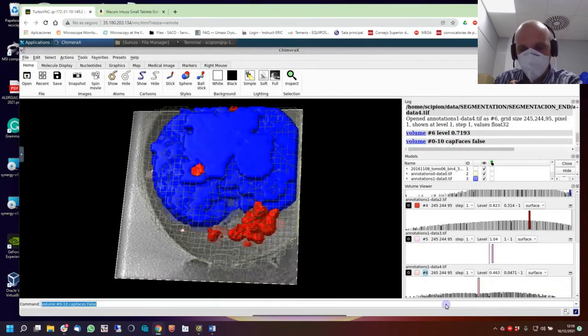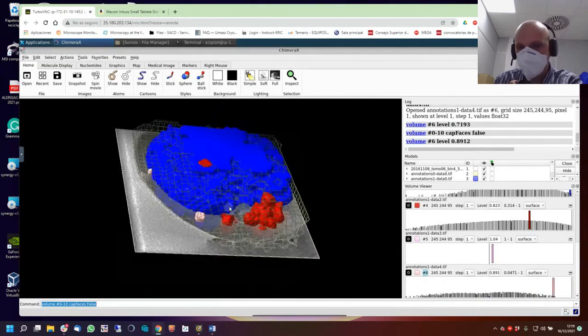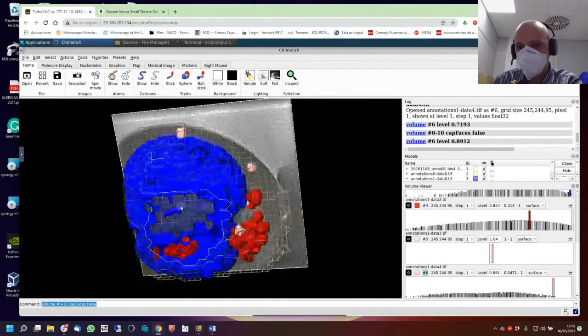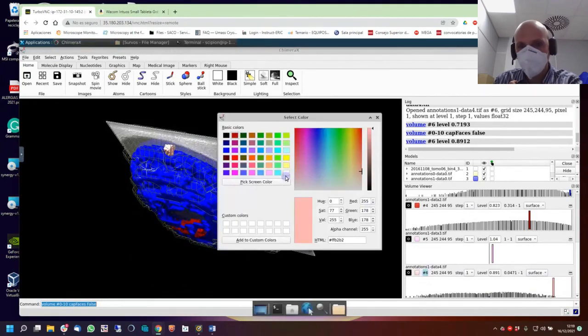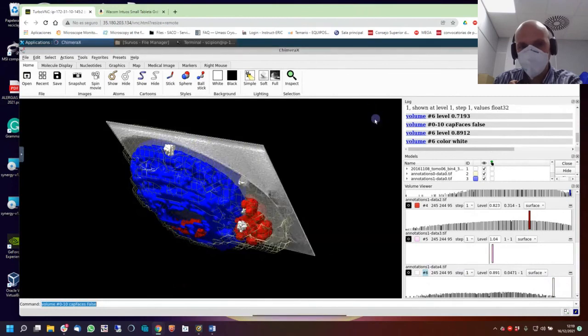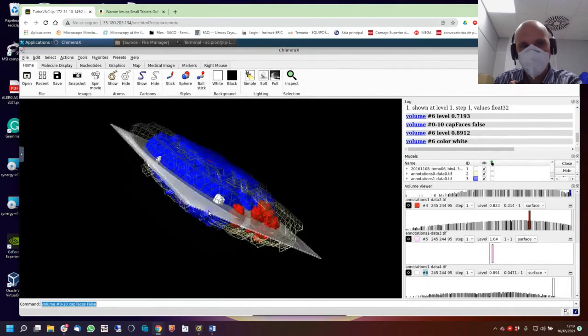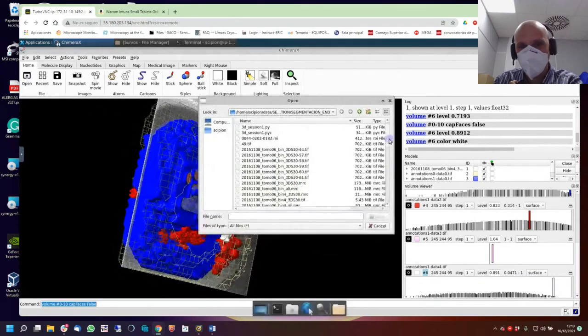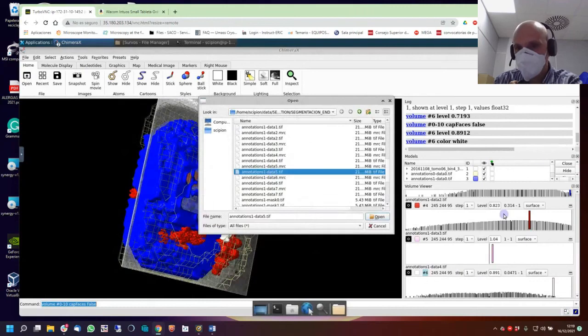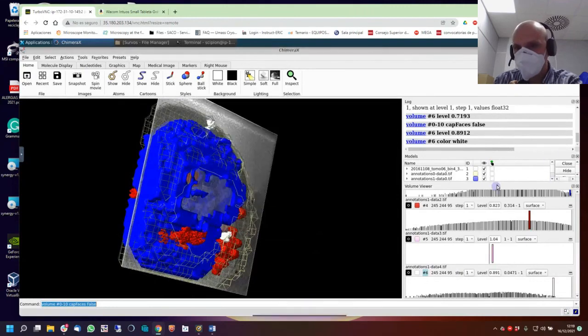Yeah, there are two small white vesicles. So we wanted to have it white. Why not? I wanted it white. Okay, open. The 5. You forgot it, doesn't matter. Go back. 4, yes, we go for 5. Open.